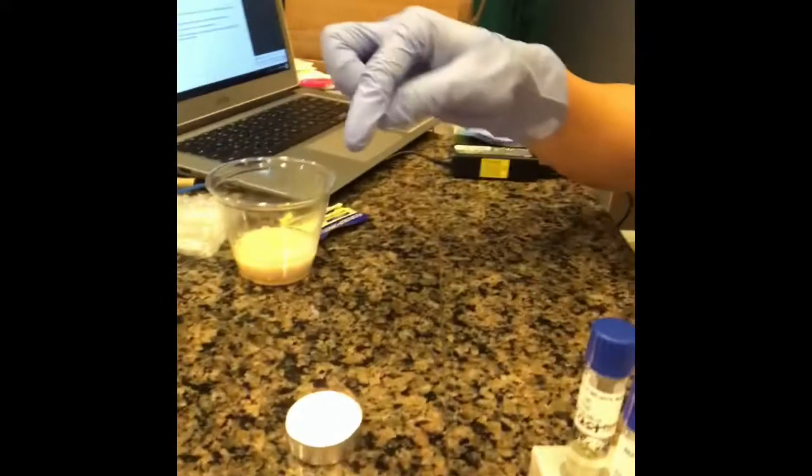And what I did first was wipe down my countertop, remove everything that I'm not gonna be using or that I don't want to get contaminated or possibly exposed to any of the stuff I'm culturing. I do have my candle lit right here, as you can tell, and I was reading over the instructions a few times just to make sure I understood what to do prior to collecting the cultures.